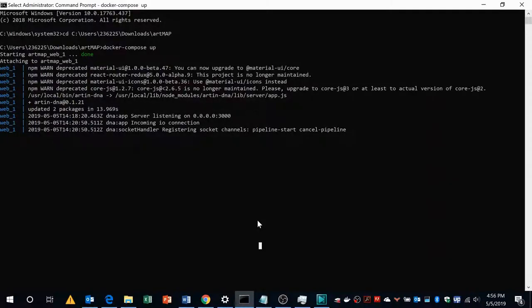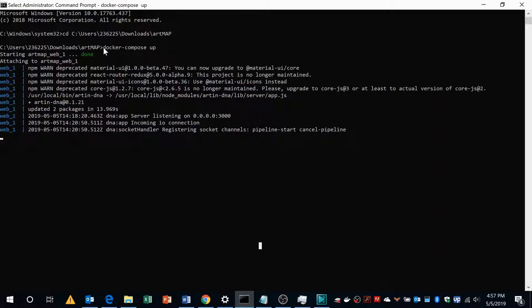Hello friends. In this tutorial we will see how to work with Artmap. To install Artmap you have to first install Docker and then execute the command docker-compose up.